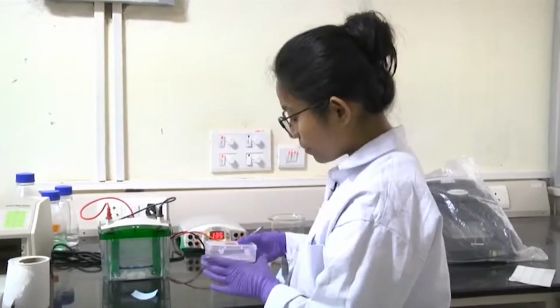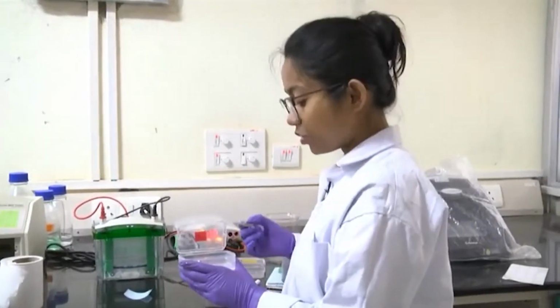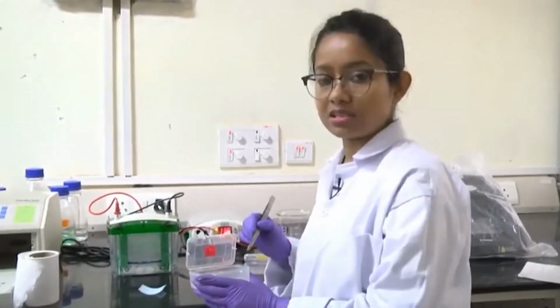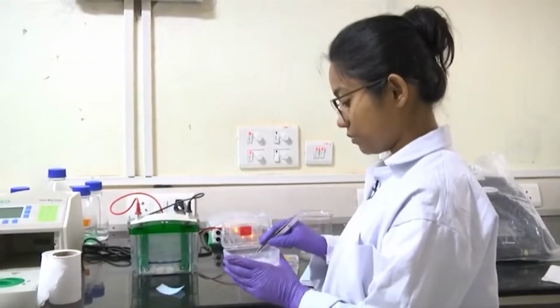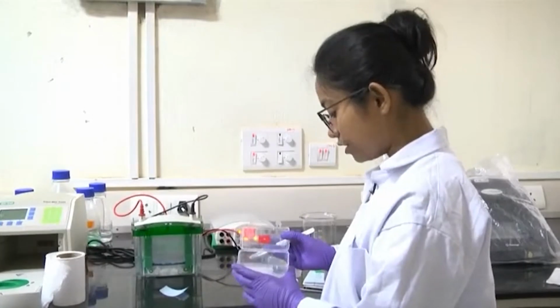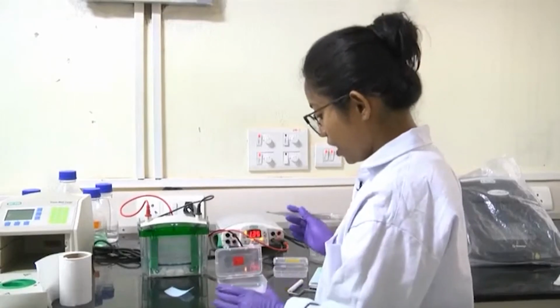If you do not activate the membrane in methanol and directly put it in the transfer buffer, you will see that the membrane is not getting soaked in the transfer buffer. That time you will know that you need to activate the membrane before putting it in the transfer buffer, because it is a hydrophobic membrane, it will not get soaked. Here my membrane is already pre-activated and it is already soaking in the transfer buffer.